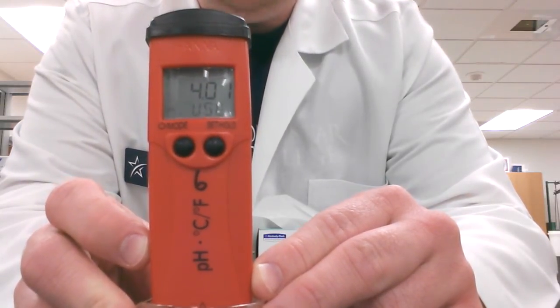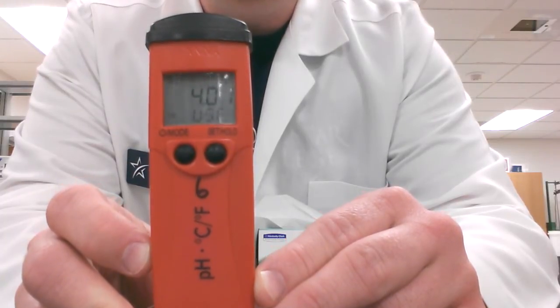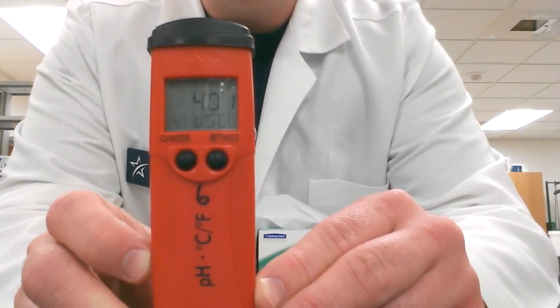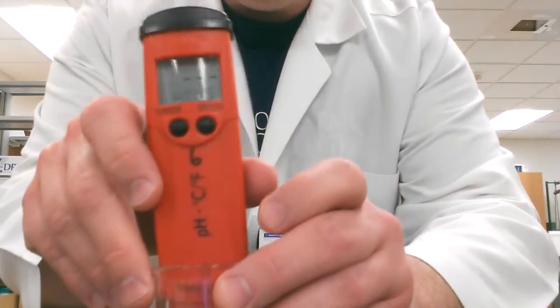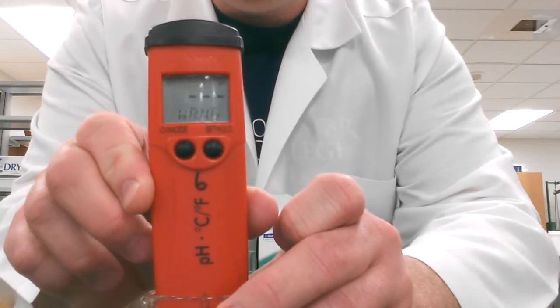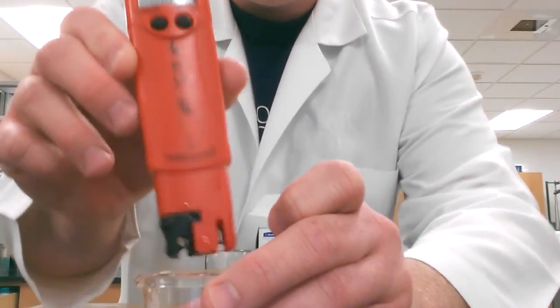After it's done calibrating using this pH 7 solution, it's going to tell you to change it to the pH 4 solution. So it's telling me I'm wrong right now because it's saying to put it in the 4, but it's still in the 7. So we're going to take it out of the 7 solution.